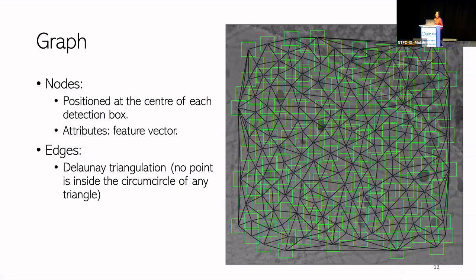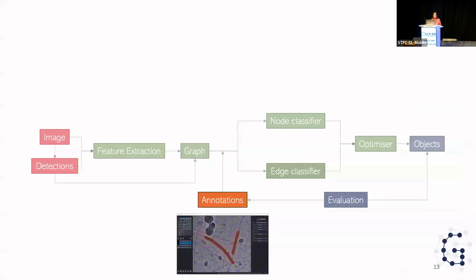And now what we want to know is, can we retrieve objects or smaller structures from this organized space? This is when we need some input from you, because we need to know what we are looking for. This is the only part where we need some annotations from you. And you're like, more annotations? Sorry. We do need to know what we look at.